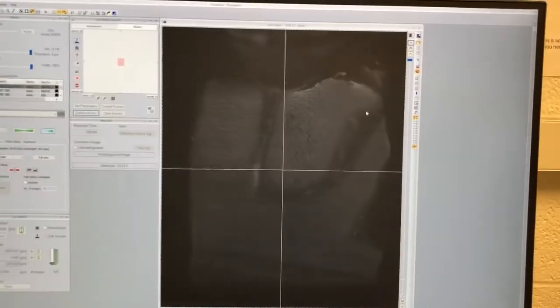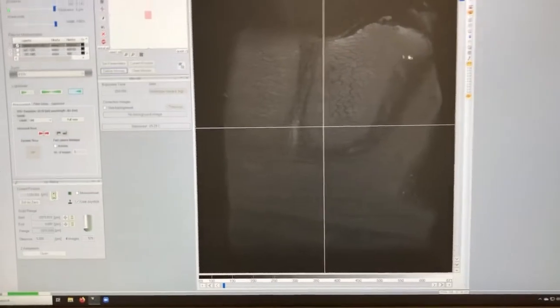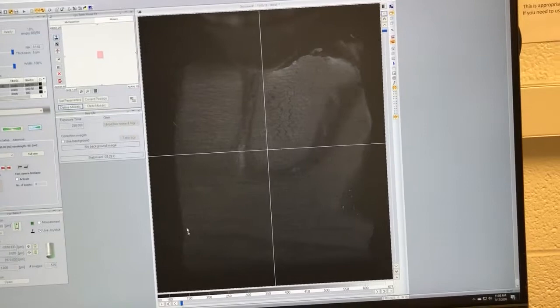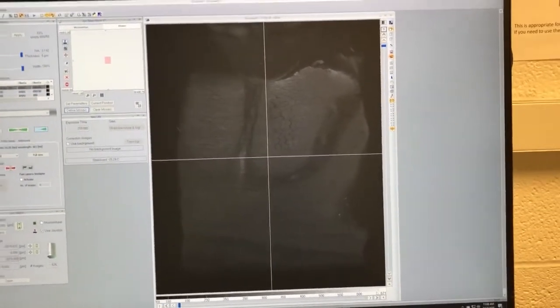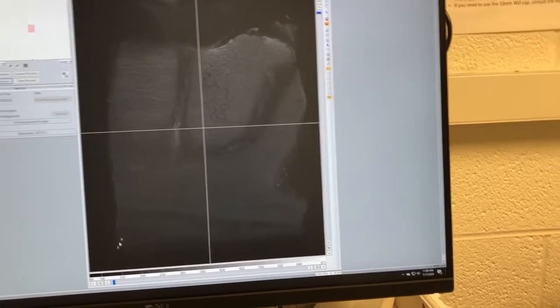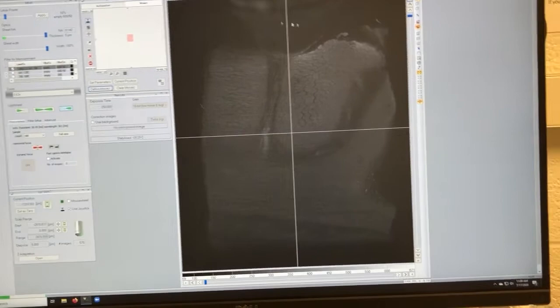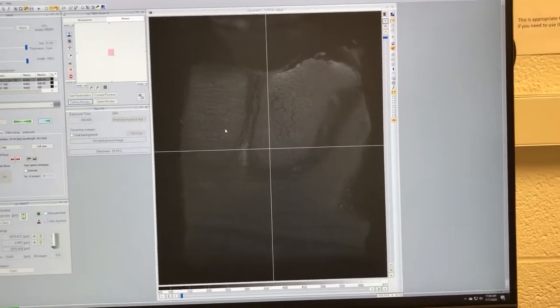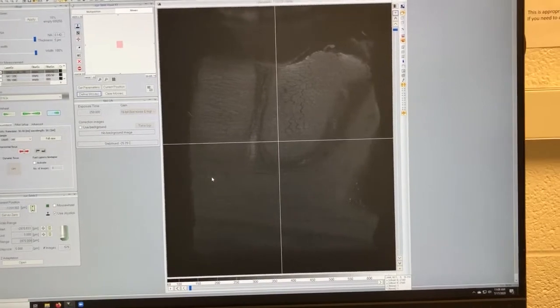There is a caveat to getting all the detail for free: the very edges of the field of view have worse quality. As I explained in my light sheet microscopy lecture, there are radial distortions as you move away from the center — the objective doesn't perform as well. So if you really care about structures at the edges, it might not be the best option to zoom in so that much of your sample is near the edges. But usually, zooming in until your sample always fits in the field of view and covers it nicely is a good strategy.